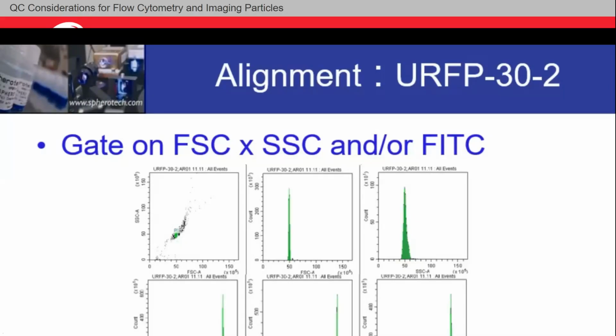You can set them at 100-100. You may already have a QA SOP'd standard for which you're supposed to set these particles. If we look at these other channels below, I'm setting them all to 10 to the 5th, or 10 to the 6th rather. But what's more important is these are on log scale, right? We run our fluorescence channels on log. We run our forward and side scatter on linear.